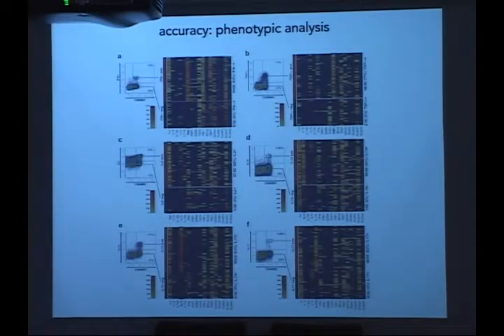So we tested the accuracy of our phenotyping technology by using these cytokine capture assays by Miltenyi. We couldn't use intracellular staining because then we couldn't do our reactions because of the cell fixation. But Miltenyi sells these kits where you basically capture an antibody on the surface without fixing the cell. So they have interferon gamma, TNF, and various interleukins available.